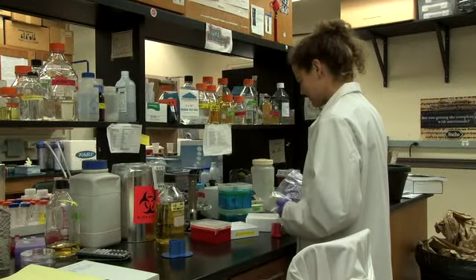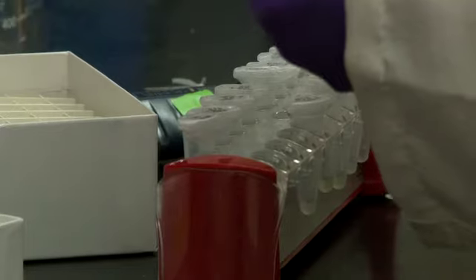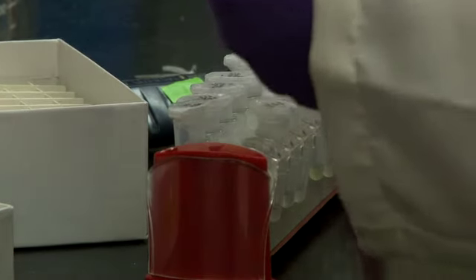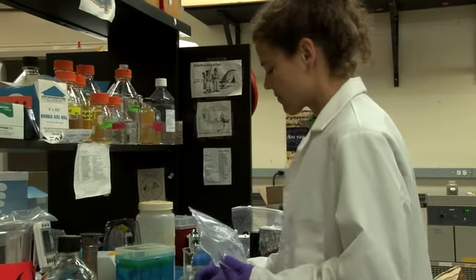In high-throughput sequencing technology, once you have transferred your data and once you have stored it, there are multiple layers of DNA analysis that go from the basic processing of the raw data to DNA sequences that people can visualize, and then additional post-step analysis so that people can interpret what these DNA sequences mean.